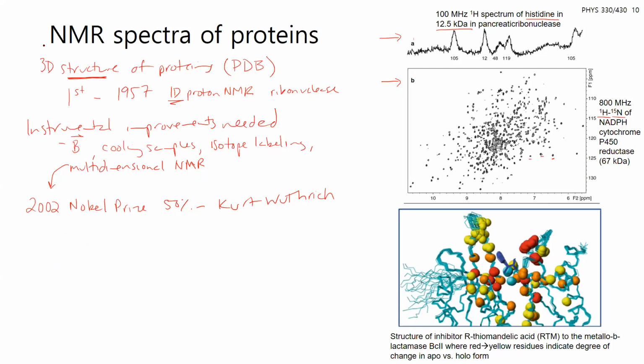I also want to mention that when we're talking about the benefits, the dynamics in proteins and other biomolecules that NMR can access range from pico to nanosecond dynamics, looking at spin relaxation phenomena. You can also get to milliseconds to seconds when you're looking at how line shapes change over time.